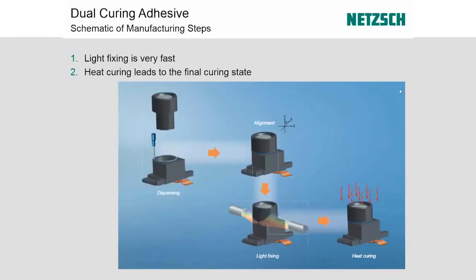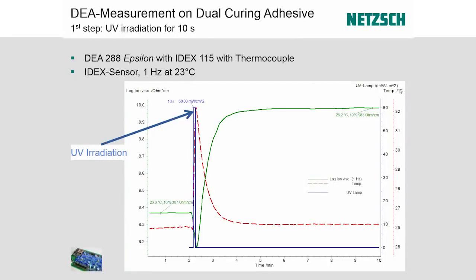And if you want to do a dual cure, so if you remember early on, we had 3 types of UV curing, and the third was that dual cure. So in this case, this is where you put a part into an area that already has a UV resin dispersed on it. You then fix it in place with UV curing, then you heat it afterwards to finish the cure. So that's what we're looking at right here.